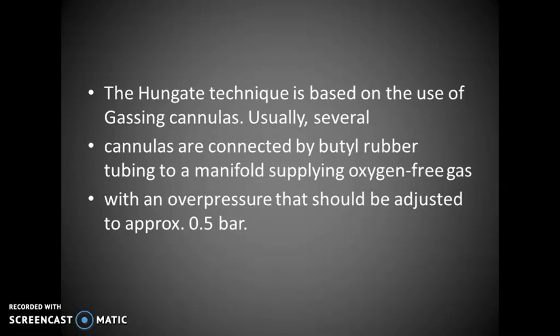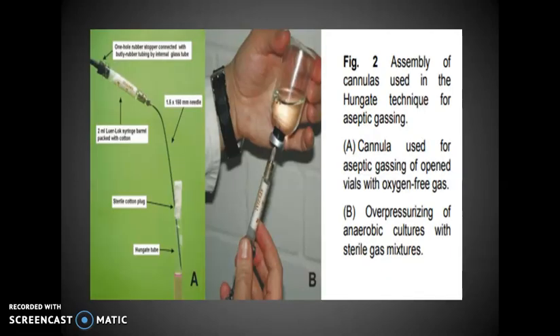And this Hungate technique is based on the use of gassing cannulas, etc. So this is the assembly of the cannulas used in the Hungate technique for aseptic gassing.